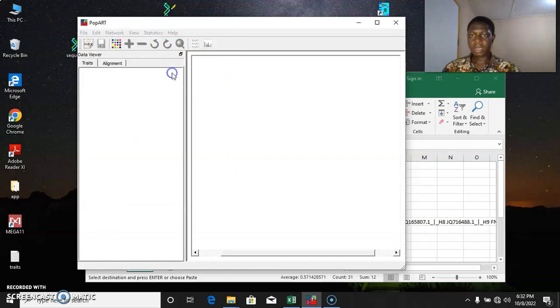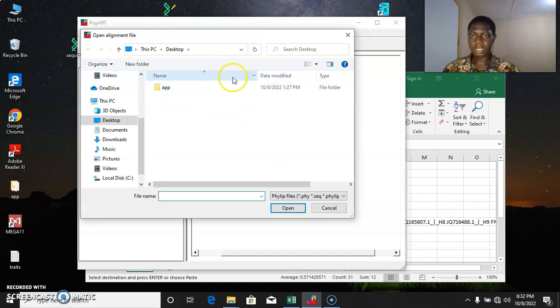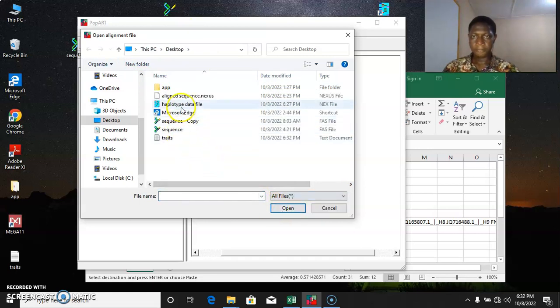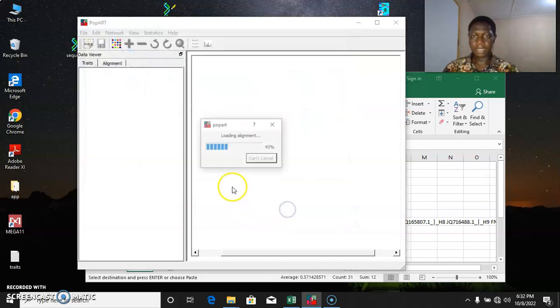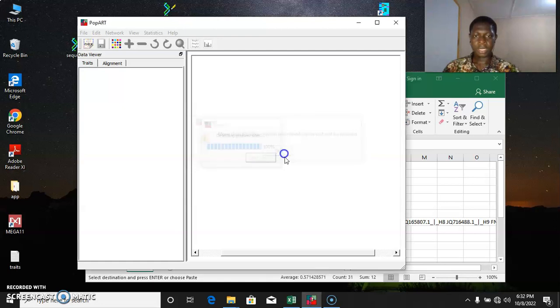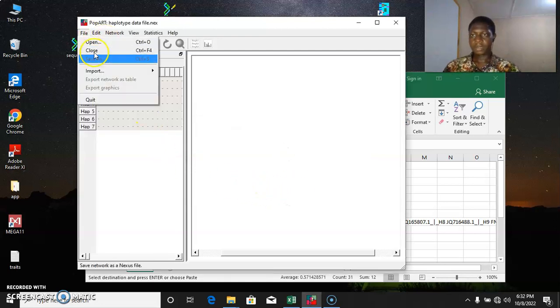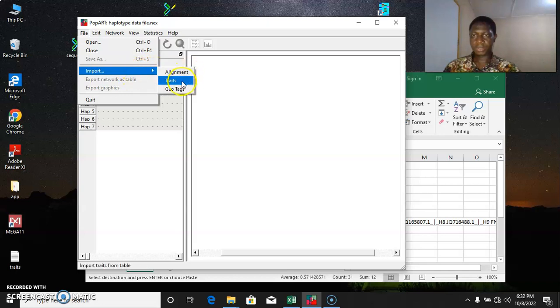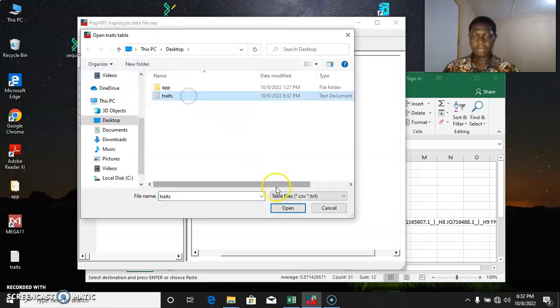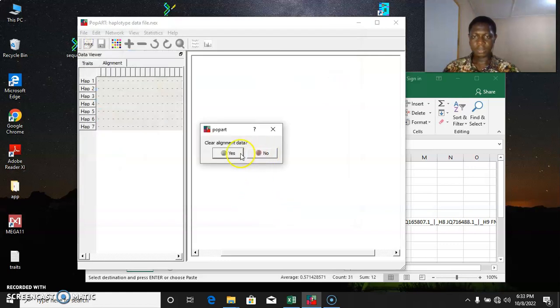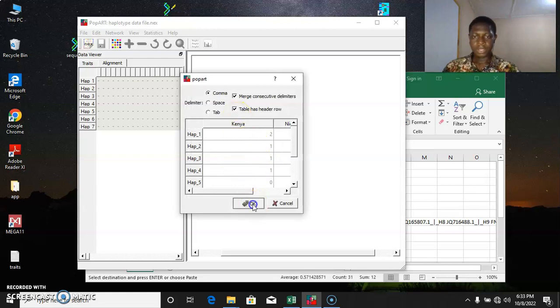So we import our alignment — once you select Import, it brings this option, then you select all files. The file you have to select is the haplotype data file. Select that, it will bring this option, select OK. Then come to Import and import the traits. Simply select Traits, clear alignment data — no. Simply press OK.